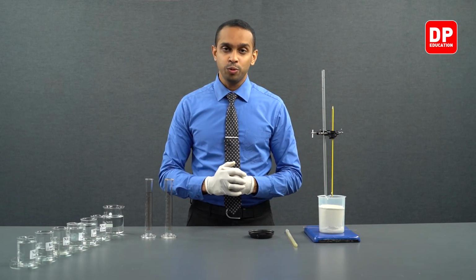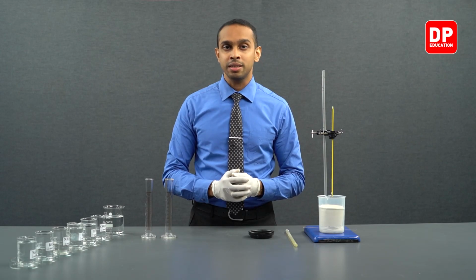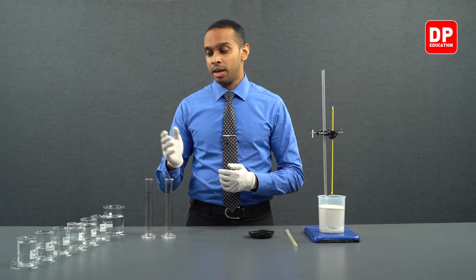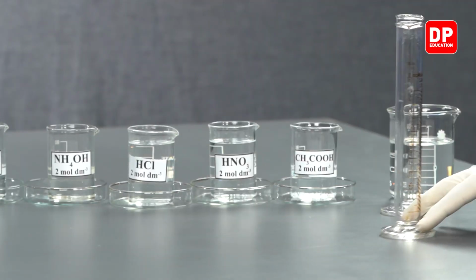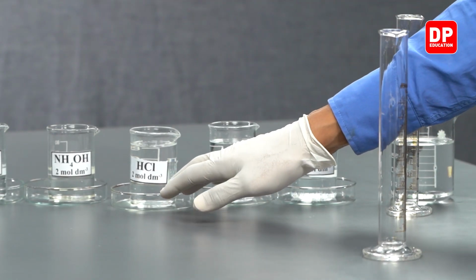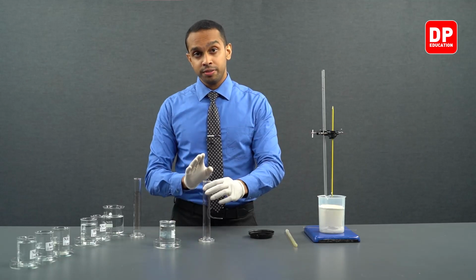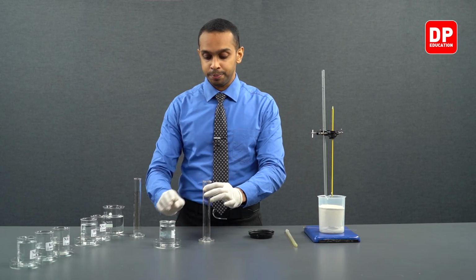Now, let's move on to adding our HCl into this plastic container, and afterwards let's take the temperature readings of HCl and the sodium hydroxide we're adding to this reaction mixture. We have our measuring cylinder here, and let's take our HCl solution and let's add 50 milliliters of HCl into this beaker.